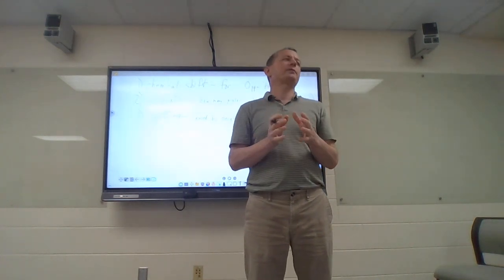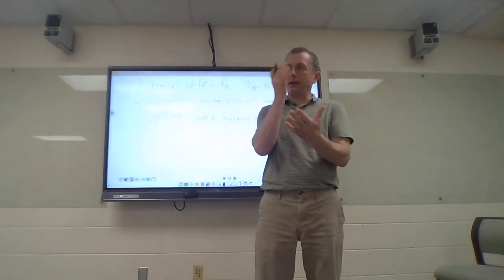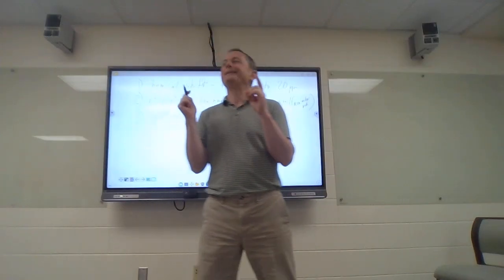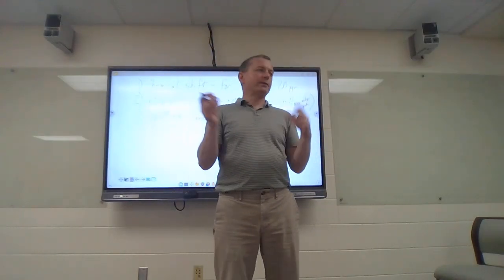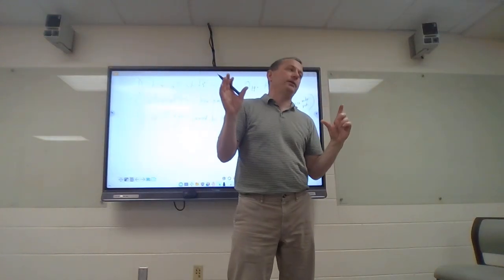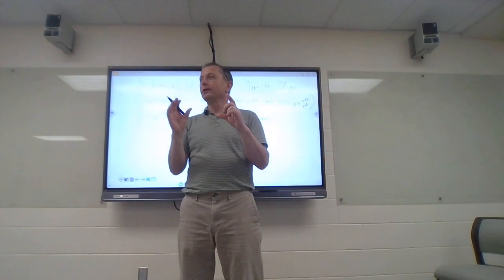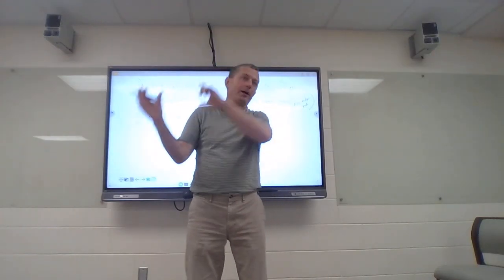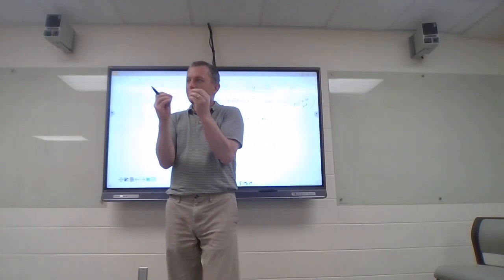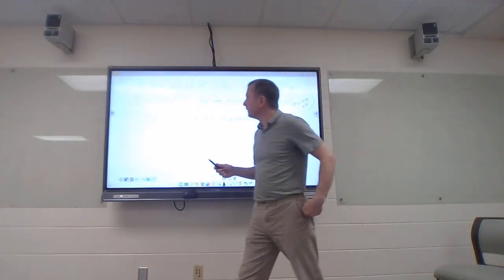It is not the same as X-ray. I am not looking at the exact spectra. However, by deduction, you're going to be able to say, oh, I have these kinds of hydrogens, and they're next to these kinds of hydrogens. Therefore, I'm going to put them on the next carbon over and start to build the molecule together. And you can really solve some very complex spectra.